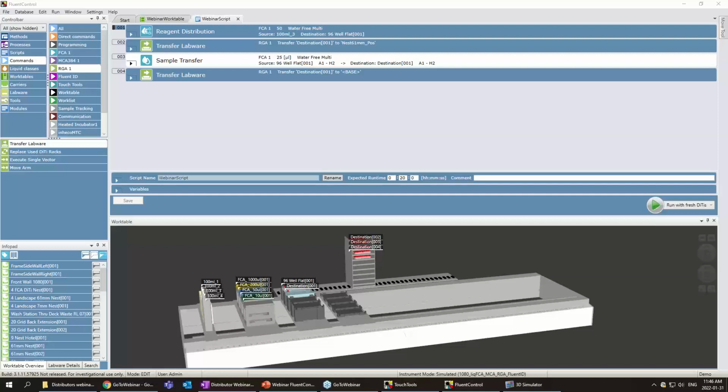Yes, Dutis. And then the other question was, if we want to fill multiple plates from a hotel, how would we do it? If there should be separate lines for transfer and pipetting for every plate. Yeah, I mean, you can make a loop to transfer a plate and fill it and put it back again and use a variable for the site and the transfer labware, right? Exactly. Yeah, that's what you can do.